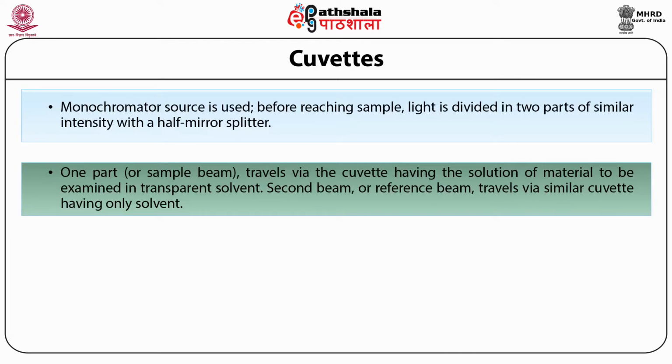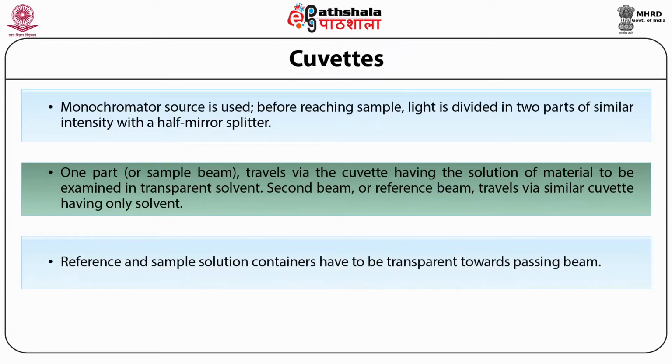The second beam, or reference beam, travels via a similar cuvette, having only the solvent. So reference and sample solution containers have to be transparent towards the passing beam.